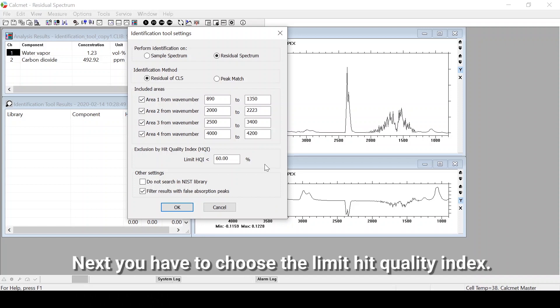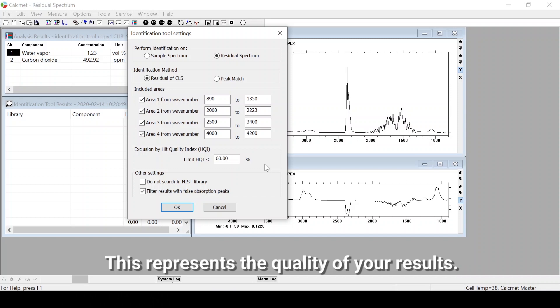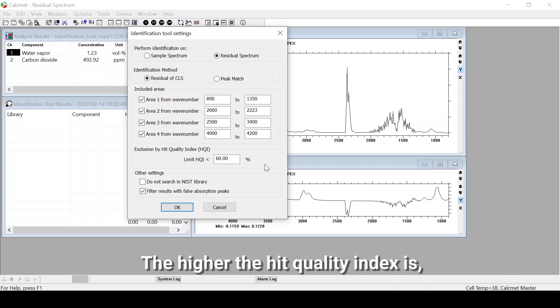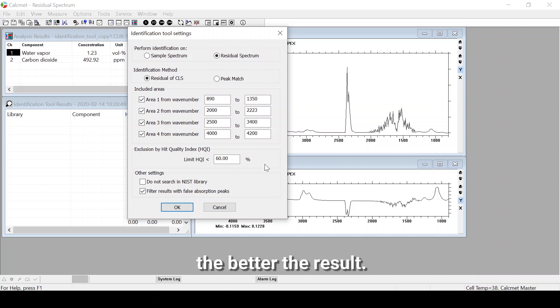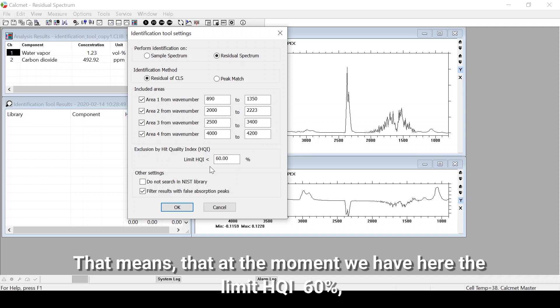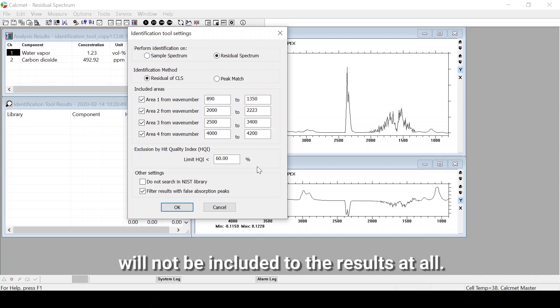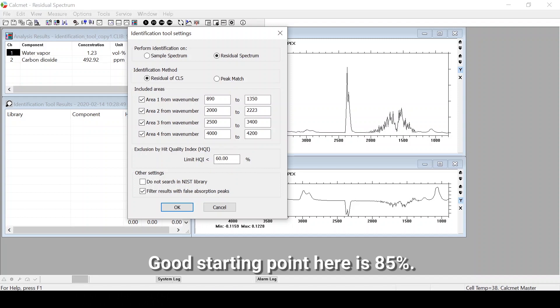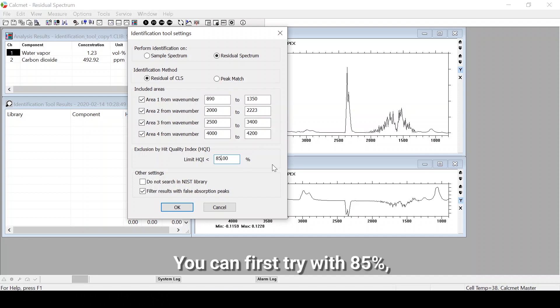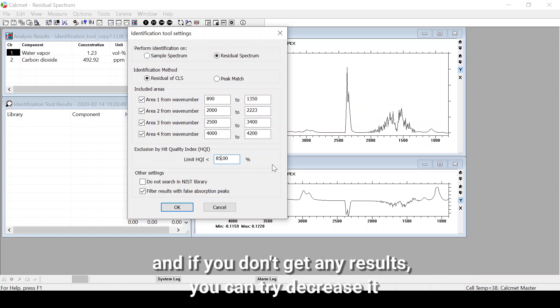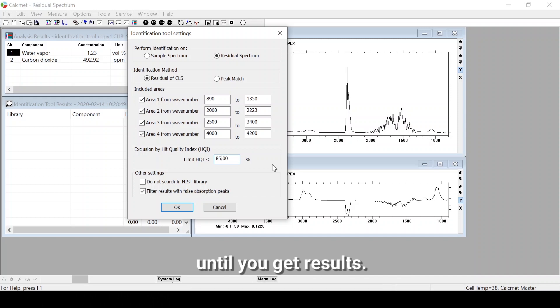Next you have to choose the limit heat quality index, which represents the quality of your results — the higher the heat quality index, the better the result. At the moment the limit heat quality index is set to 60%, meaning all results below 60% will not be included in the results at all. A good starting point is 85%. You can first try with 85% and if you don't get any results you can decrease it until you get results.